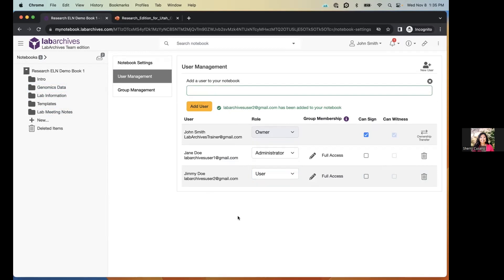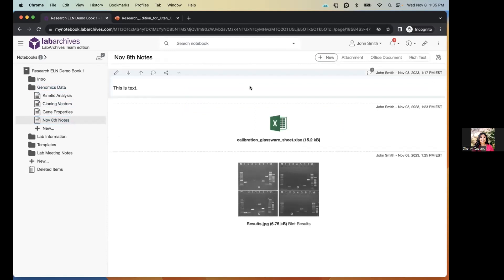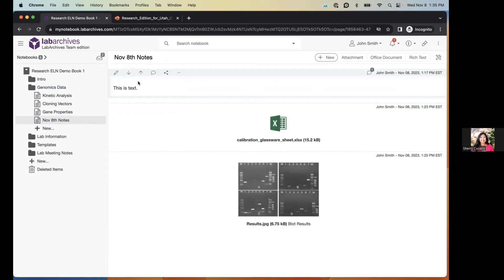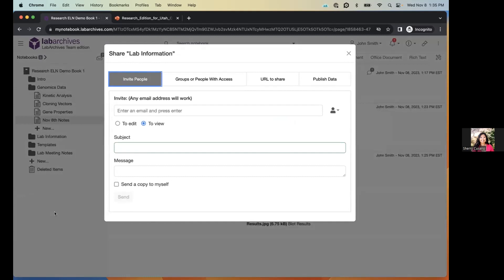You don't have to add someone to the entire notebook — you can add them to just one folder, one page, or even one entry. To share a single page, click the page tools icon and select 'Share Page.' To share one entry, hover over it and click the share button. To share a folder, right-click and select 'Share.' All these share buttons produce a share window where you enter the individual's email — they're added as a guest by default.